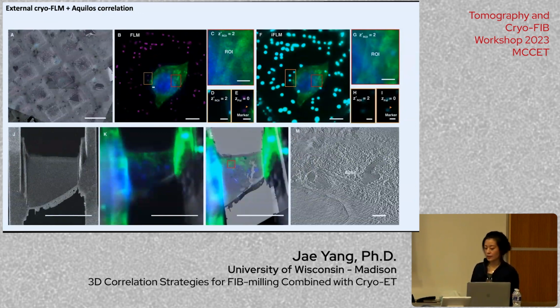And then using the relative positions between the ROI and the fiducial, as I just mentioned, this works very well, but you do need to make sure that the relative position is close enough because the lamella is moving. So I only correlated once at the very beginning, and using the geometric transformation method that I mentioned above, approach 4, I go all the way down in the auto mode, no manual intervention at all, all the way down to 200 nanometers.